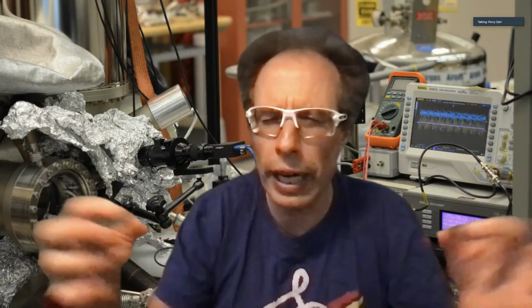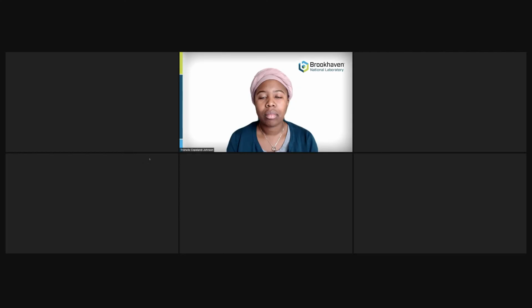So you see two atoms bond together, you can't see any structures in between. Percy and Kankona on YouTube asks if they have to be 2D materials for you to be able to analyze the samples, or can you extrapolate into nanoparticles, like to get Janus nanoparticles?